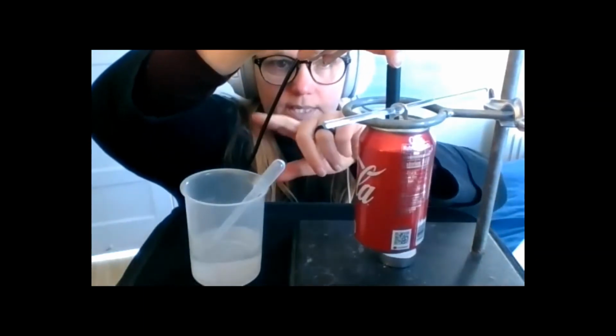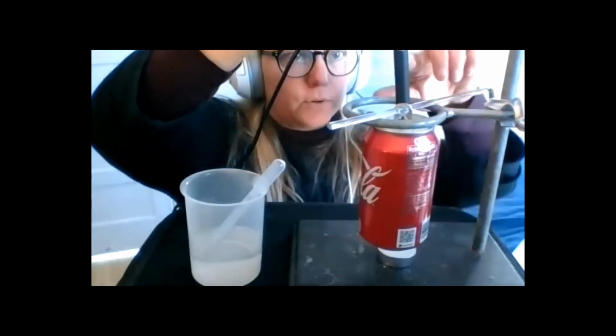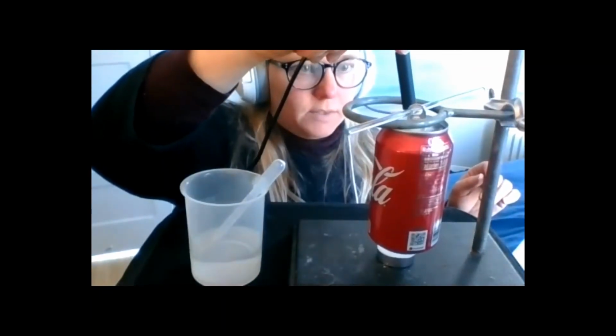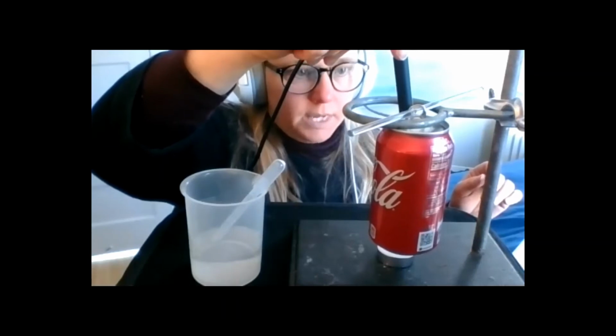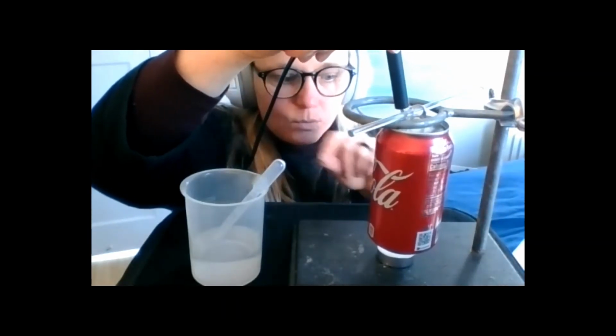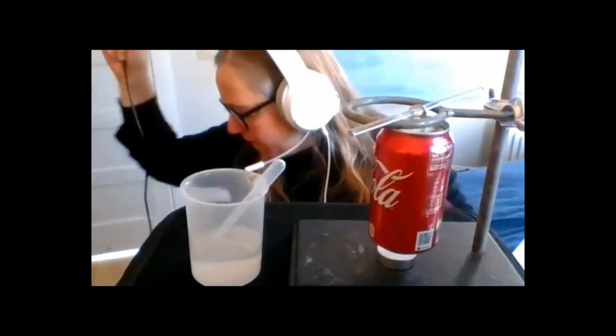Just be careful not to get the cord burned or any of the plastic parts. But this stainless steel thing is pretty tough. So you just keep track of the temperature of the water. And if you know just how much the water heats up, we'll know how much energy this candle put off.